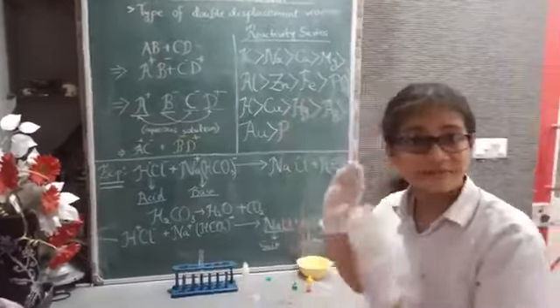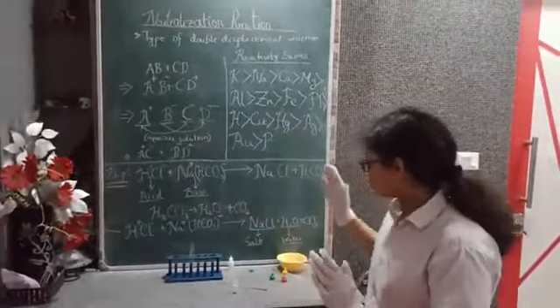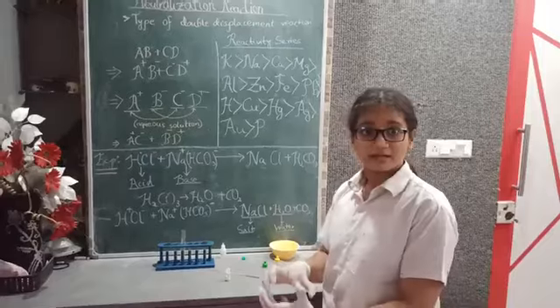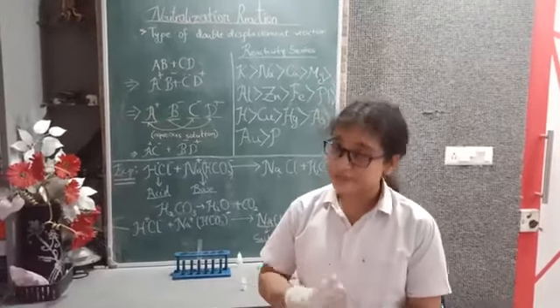As you can see, this is a very interesting experiment because you saw how hydrochloric acid mixed with the base, which is sodium bicarbonate, and in this experiment literally neutralized perfectly. So right now I hope you have learned something new and also enjoyed this video.